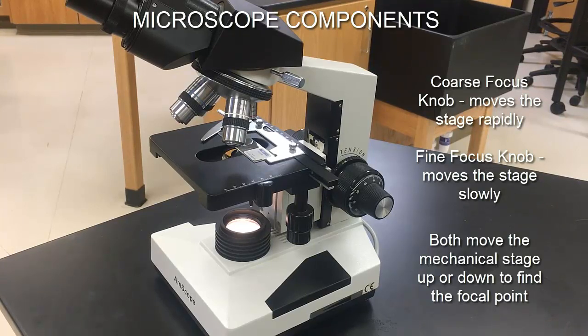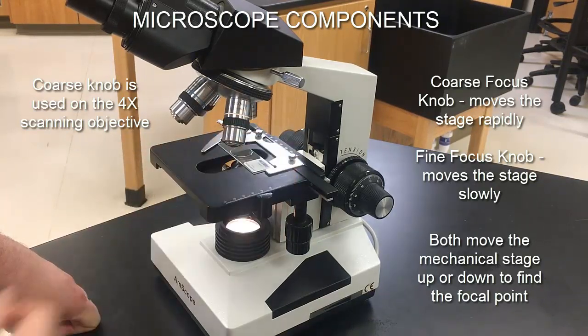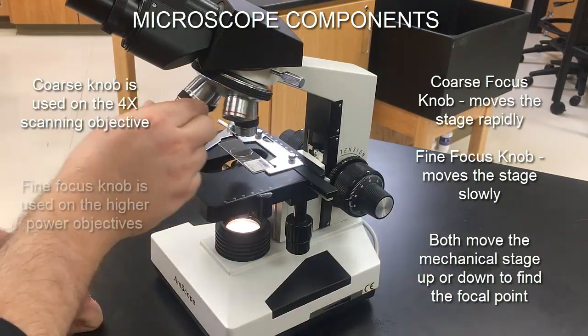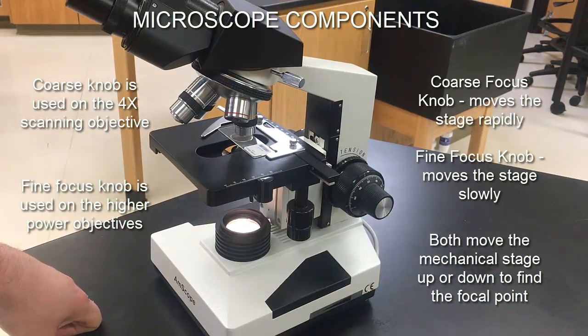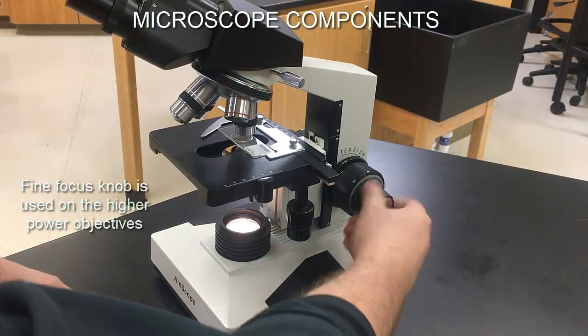As we get to the higher power objectives, the fine knob becomes more and more important. Typically we use the coarse knob on the very first 4x objective, because there we have the greatest distance to cover. As we get to higher power objectives, the lens will already be close to the slide, so we'll just need to fine tune with the fine focus knob.